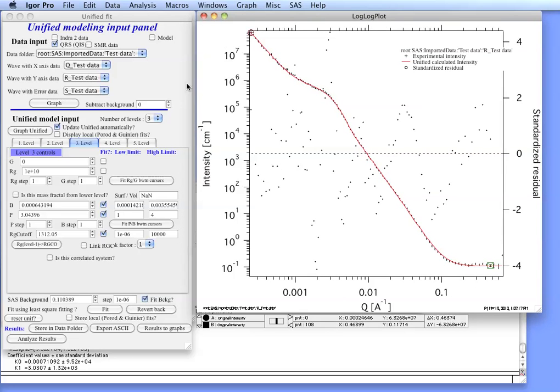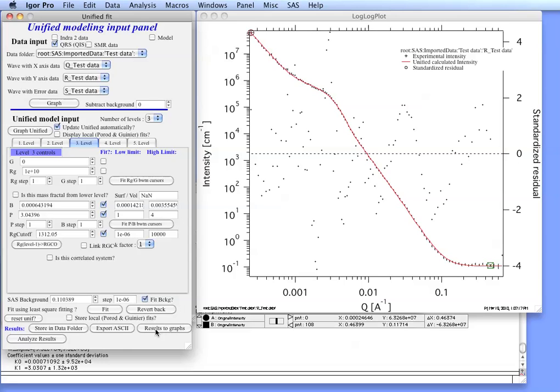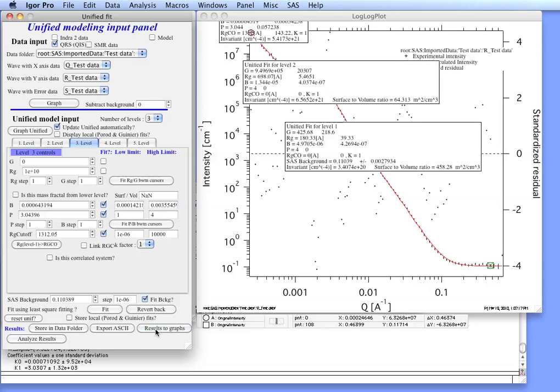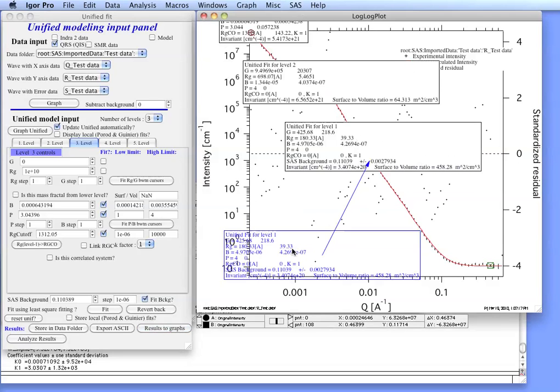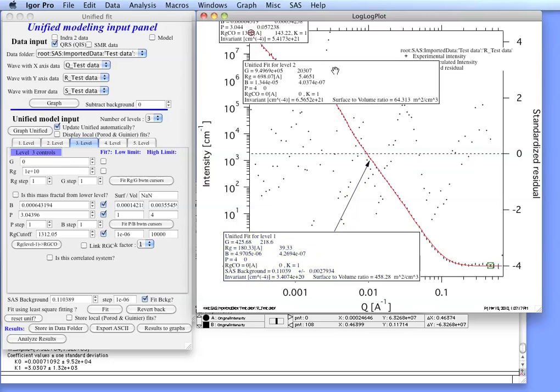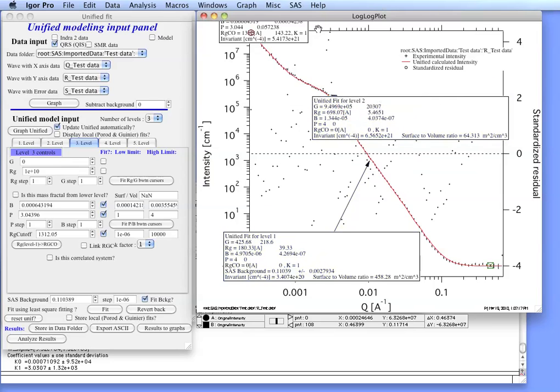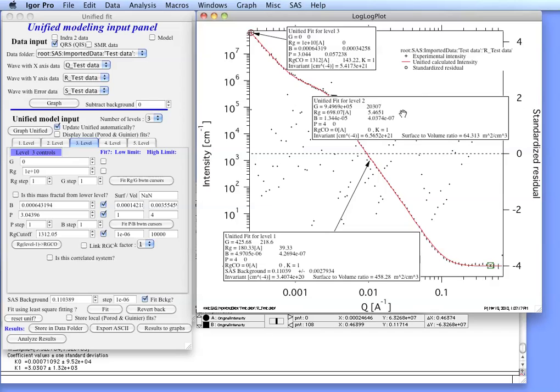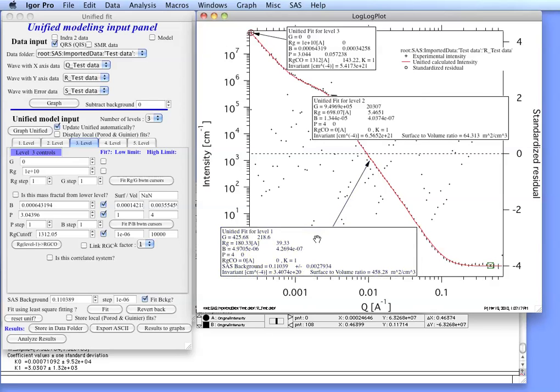We have other options which we can do with the latest version of IRENA. You can put results to graph and in this case you can see that you are going to get these tags with results.